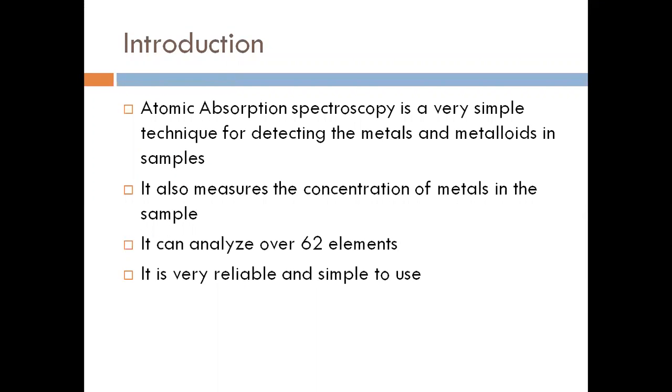First of all, Introduction. Atomic absorption spectroscopy, or AAS, is an analytic technique commonly used for qualitative and quantitative determination of elements in samples such as aqueous solutions, waters, metals, metalloids, glass, drugs, food, environmental samples, waste and biological samples. The technique is based on measuring the amount of electromagnetic energy of a particular wavelength which is absorbed as it passes through a cloud of atoms of a particular chemical element coming from sample and standards.